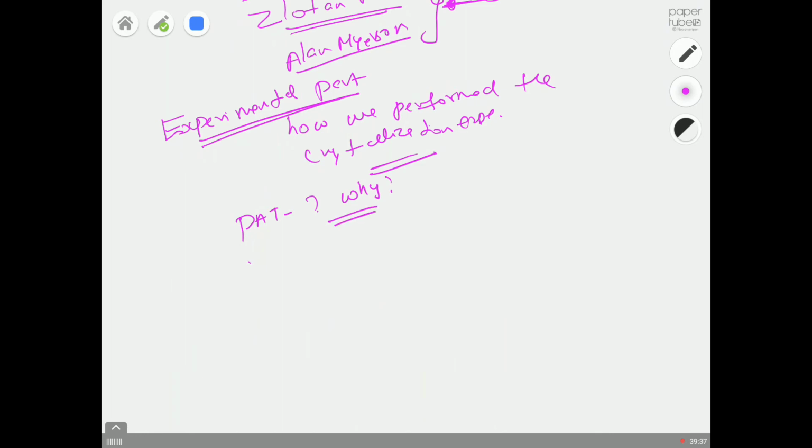So we used FTIR, and then we talk a bit about principles of FTIR, and then principles of how the FBRM works, and then how the PVM works. So FTIR is something like what we are measuring is absorbance. We are not directly measuring the concentration. I already showed you how to convert your spectra into absorbance in the video.